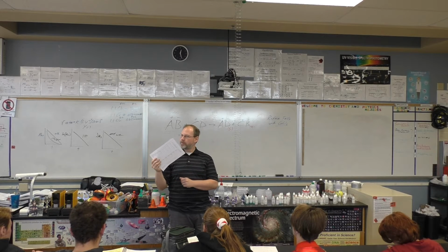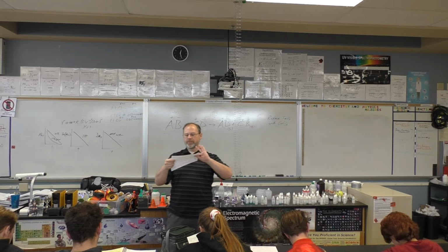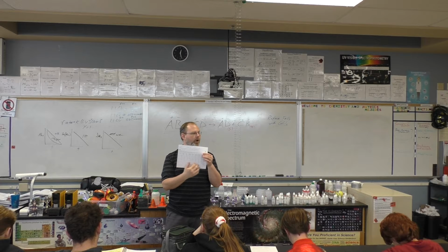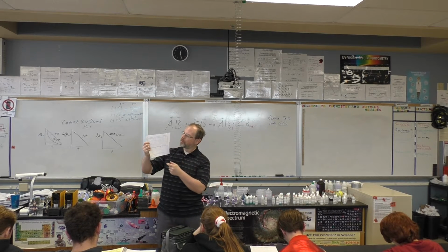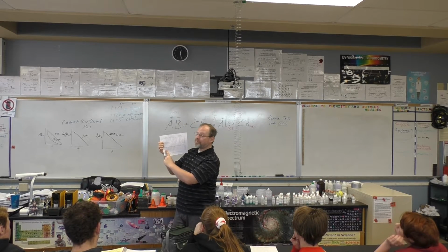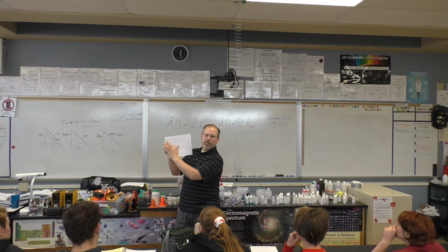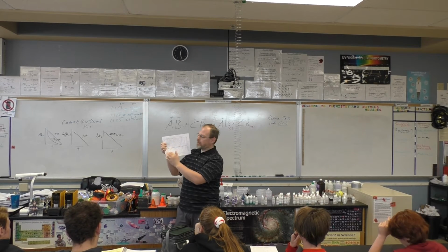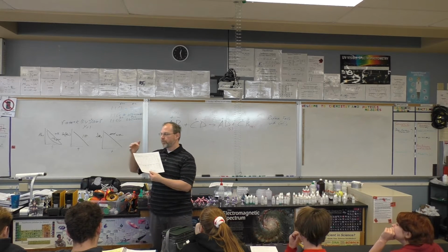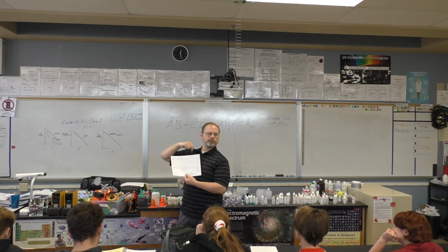And then the graded part. Part 3. In part 3, you're going to look at which reactions made precipitates, where your yeses are. And you're going to say, all right, this box here was a yes. Based on what I've seen in my entire reaction, it is probably that compound. It's going to be one of the two. So in part 3, you're going to say, based on some trends I've seen, of those two compounds, my precipitate is most likely that one.